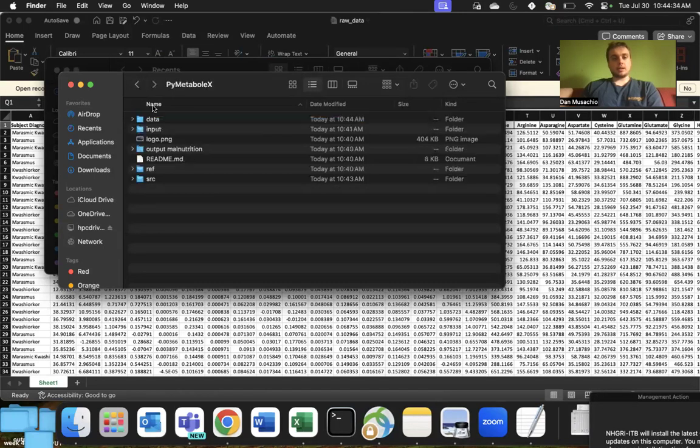And then finally, you can do this multiple times. You can run it and then change the group names again and run it, run any real combination. Then finally, we actually get what we want. It's pretty helpful for making the data better, and I think it's pretty interactive and intuitive.